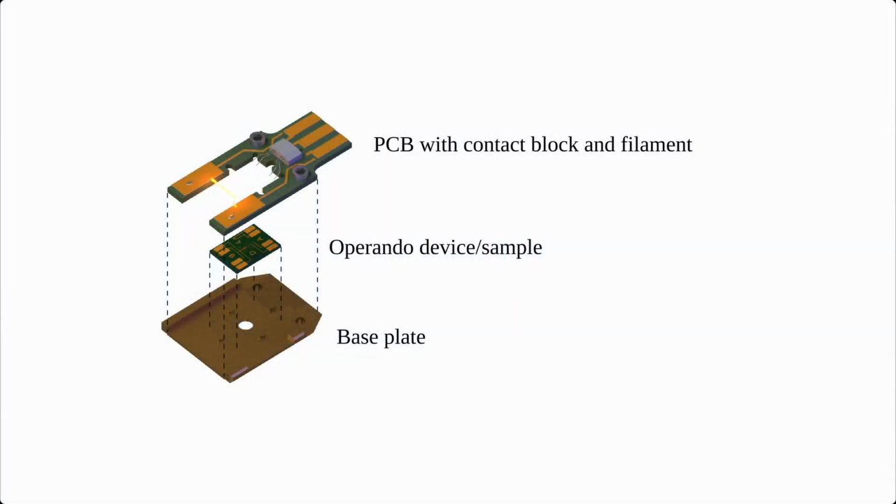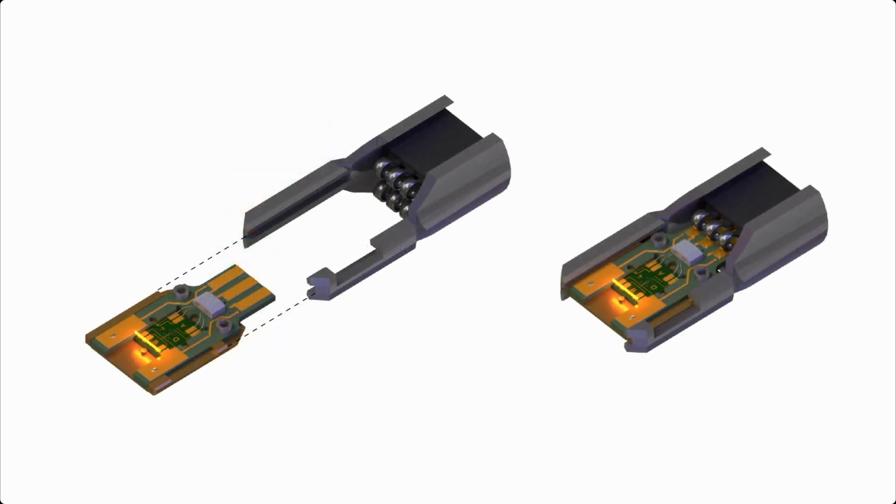The design is composed of two main parts, a printed circuit board and a metal base plate, that sandwich the sample between them and allow electrical contact to the sample. The sample dimensions are based on the Protochips heater chip and will allow electrothermal experiments with the chip itself. This assembly slides into a Nano electrical cartridge and is then fully compatible with standard microscope operation.